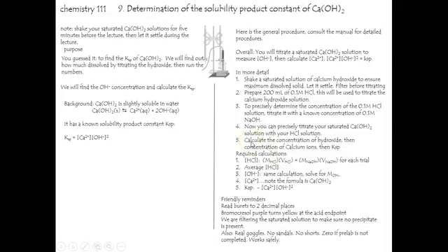until it is neutralized. Calculate the concentration of hydroxide, then the concentration of the calcium ions, and then the KSP as we went over before. You will note that in the first one you have a base in the burette and you're dripping something in. You should get a nice color change with your indicator. In the second one you'll be titrating with a different indicator known as bromocresol purple, and it will turn yellow at the acid endpoint.